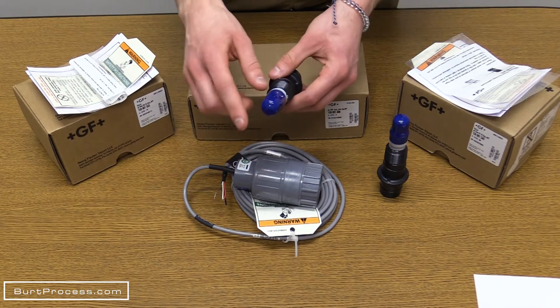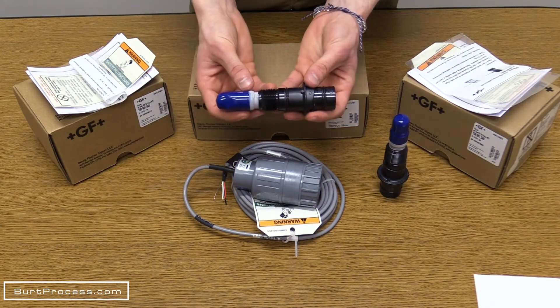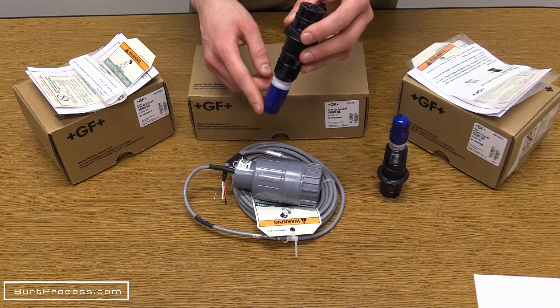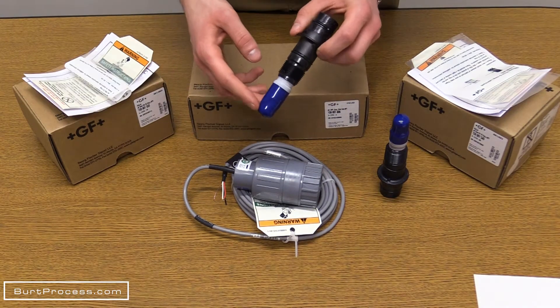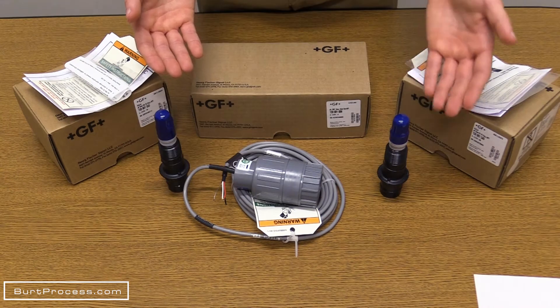When the probe is not in use, it is very important that the end of the electrode stays wet and the cap is put back in place. The probe must be submerged in conditioning solution that resides in the cap when not in use. This solution is partly acidic, so if you get it on your hands, be sure to wash them and rinse well.